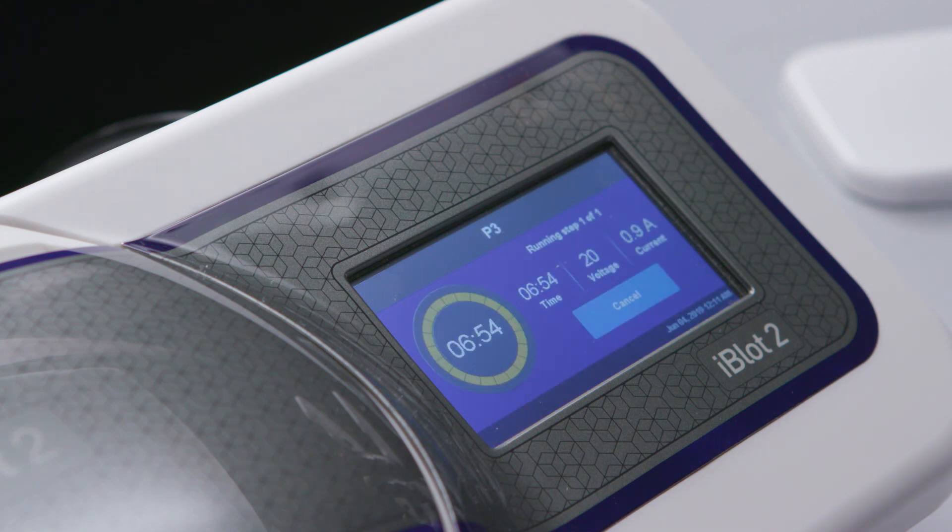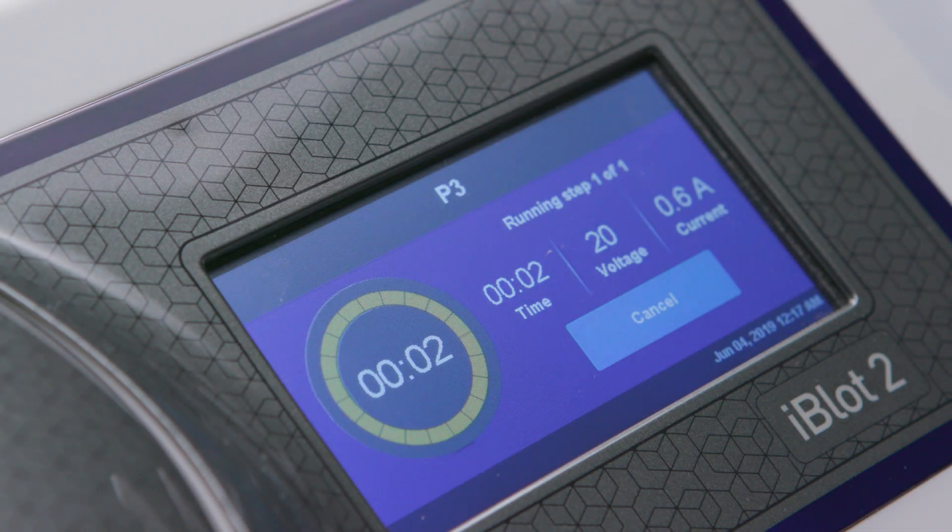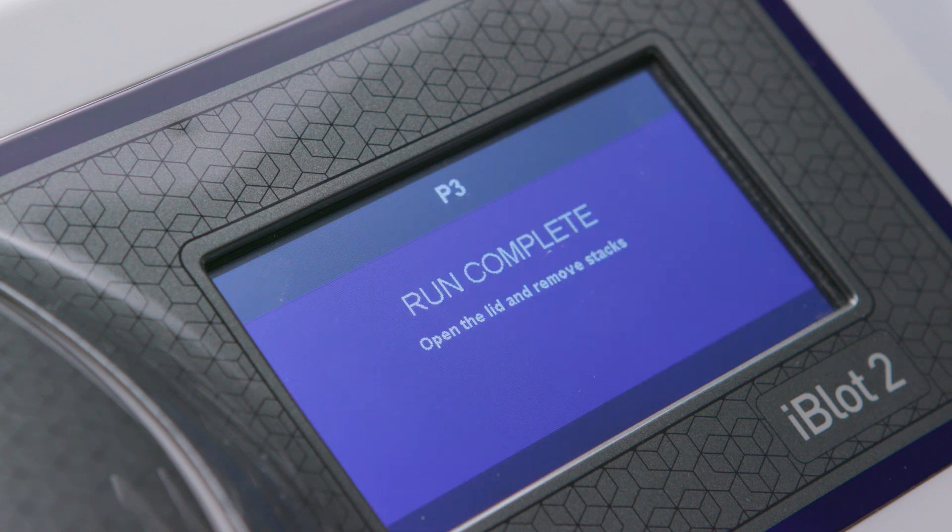Once the transfer begins, the elapsed time is displayed on the screen. The end of the transfer is indicated by beeping sounds and a message on the digital display.